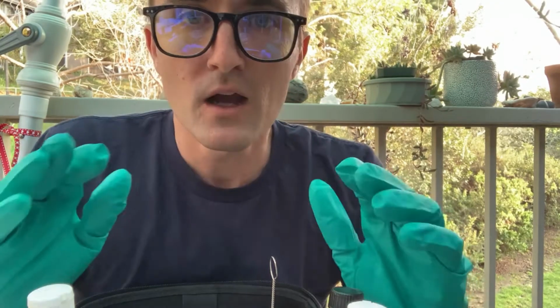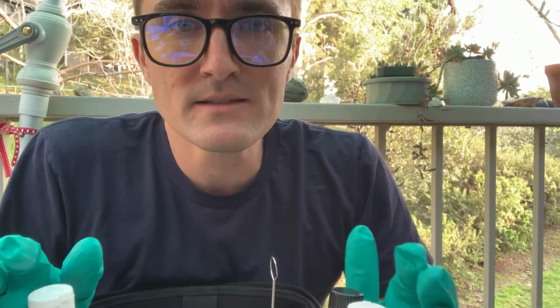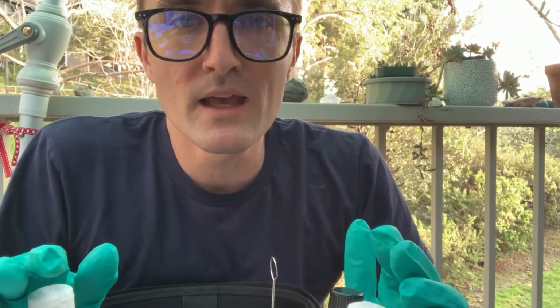We want to be very methodical and careful with how we do this. It's a lot of fun. It can be very meditative, but the goal here is precision. We're trying to be as precise as possible so that our results will actually be accurate. I'll demonstrate each of the three tests here and we can then go ahead and show you exactly what you need to do step by step in order to get these readings of our NPK.